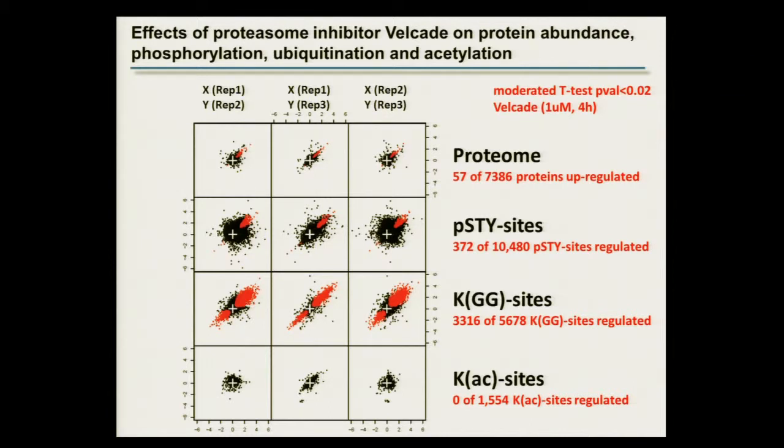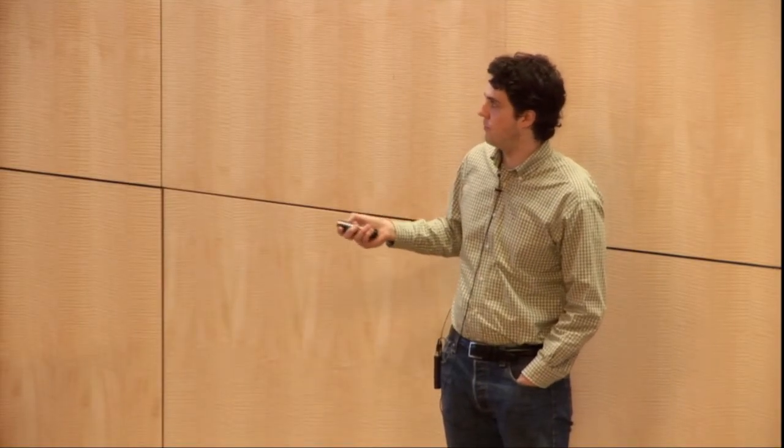So I will go into localization of PTM sites later in a couple of slides and explain that. And all of those sites have been also normalized across protein expression. So not for all sites you have protein expression data. It's pretty good with a coverage of 7,000 to 8,000 proteins already, but there's still 20% missing. And the other reason why they're a little lower is because it's overlapping fully localized sites across 3 replicates. So we only took for that analysis the highest quality part of our data that we could get to make solid statements about what changes are observed after Velcade treatment.